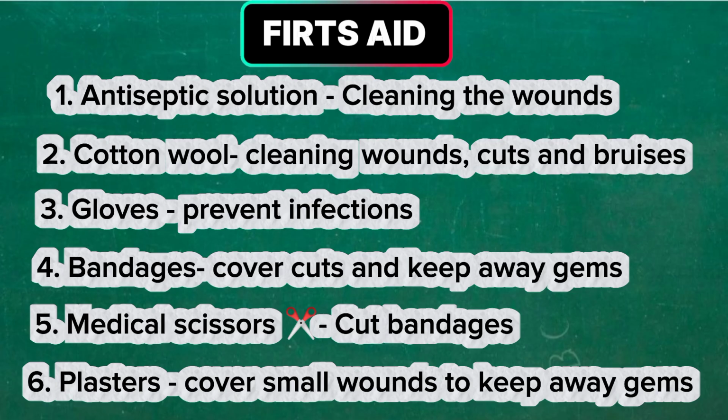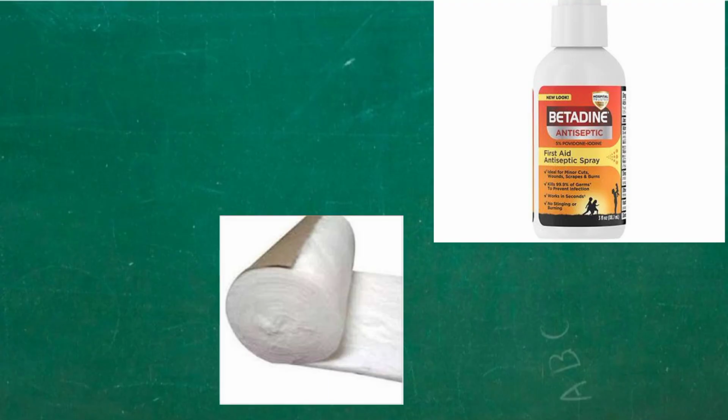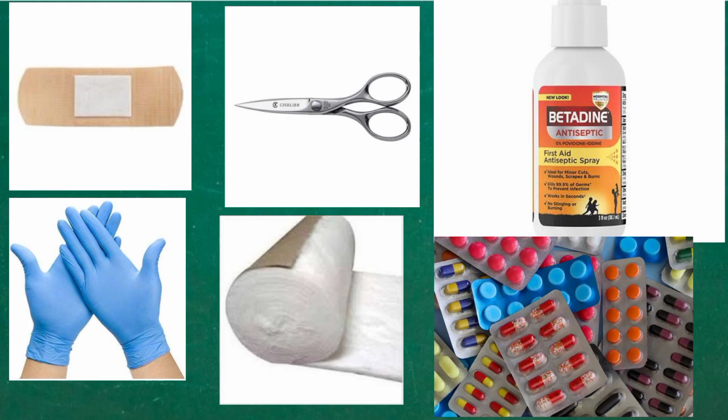When an accident occurs, whether minor or major, inform the teacher in charge or laboratory technician immediately to take action. Si kunyamaza. Make sure your teacher is aware. If the teacher is not there in the laboratory, then inform the lab technician. Mwambie kuna mtu amechomeka, kuna mtu ameguza acid, ama kuna mtu amekatwa na glass, so that the lab technician can take the required action.